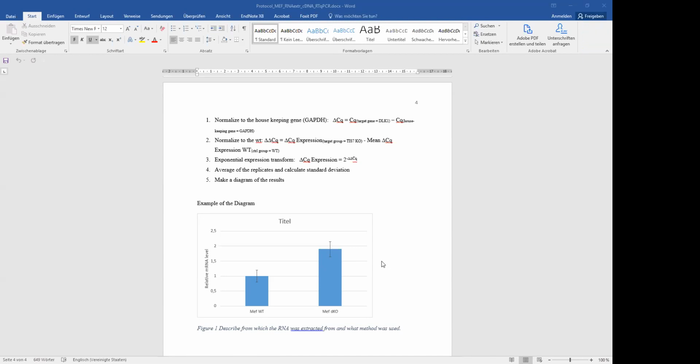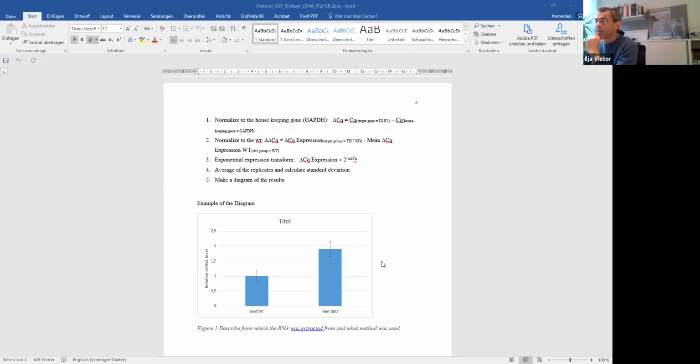I have a question. Yeah. Because I already calculated it, and I have for the T7 knockout a fold change of about 76,000. So if I want to do a graph, I can't see the wild type anymore because the wild type is around 1. So there you did a mistake, because it cannot be 76,000.